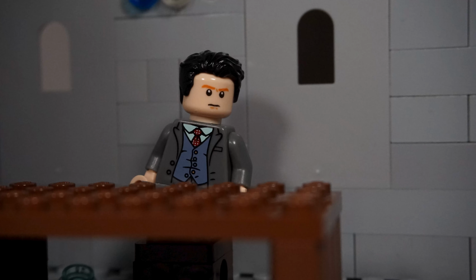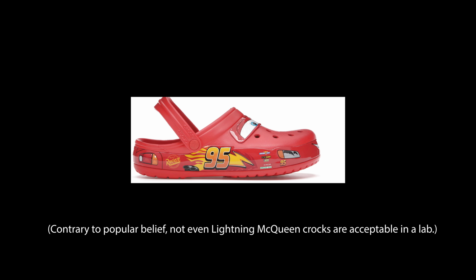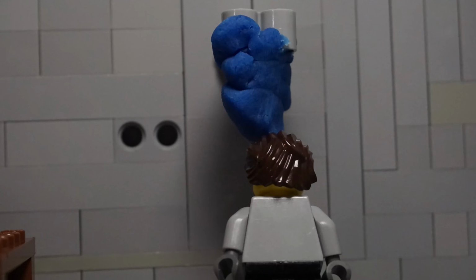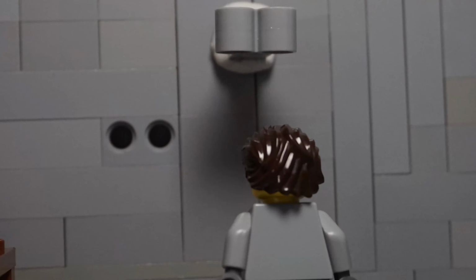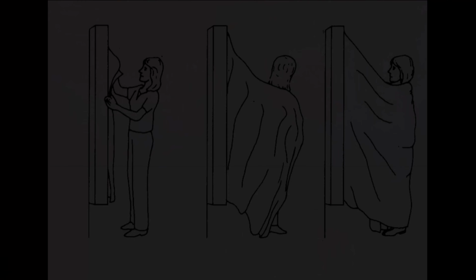Wear long pants so that your legs will not be exposed should something happen with the chemicals. Also, do not wear open-toed shoes, because they will not protect your feet should broken glass or chemicals fall on them. In the very unlikely event that somebody is on fire, a water shower or fire blanket is used. The water shower pumps out 40 to 50 gallons of water so that it can extinguish the flames as quickly as possible. Also, it cannot be turned off once on, so please keep that in mind.